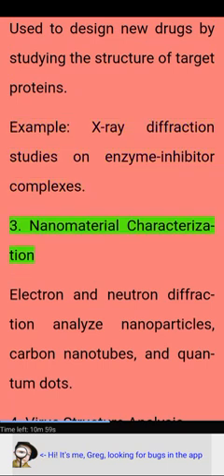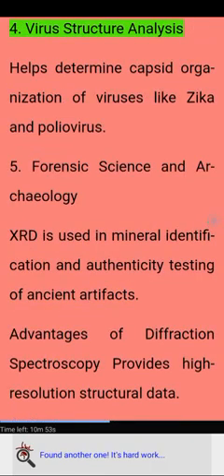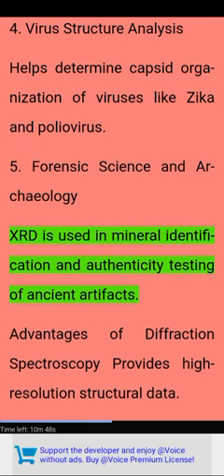3. Nanomaterial characterization. Electron and neutron diffraction analyze nanoparticles, carbon nanotubes, and quantum dots. 4. Virus structure analysis. Helps determine capsid organization of viruses like Zika and poliovirus. 5. Forensic science and archaeology. XRD is used in mineral identification and authenticity testing of ancient artifacts.